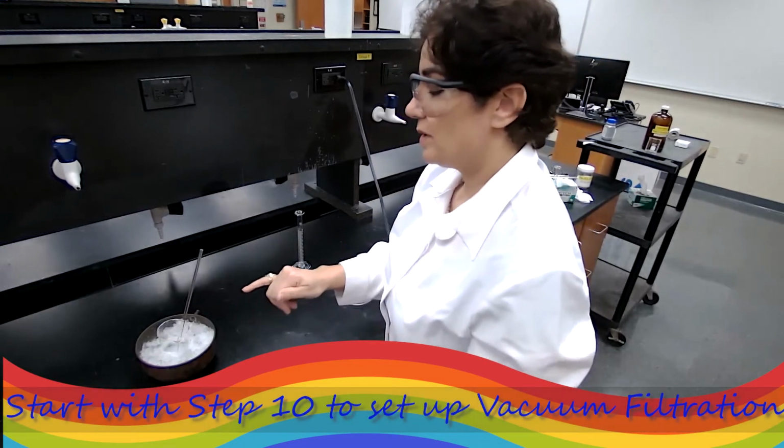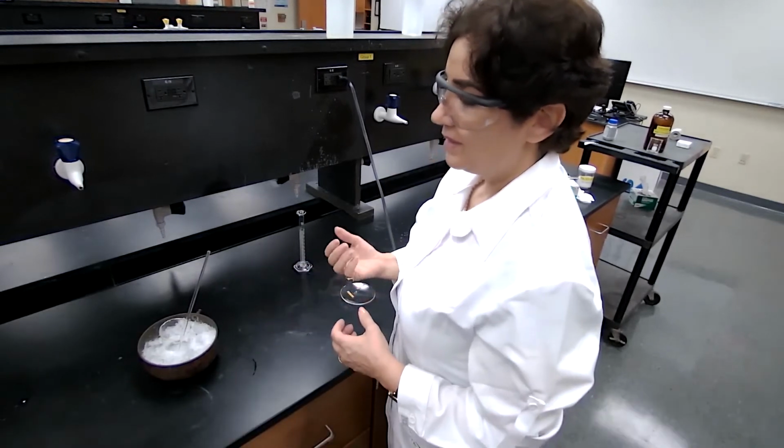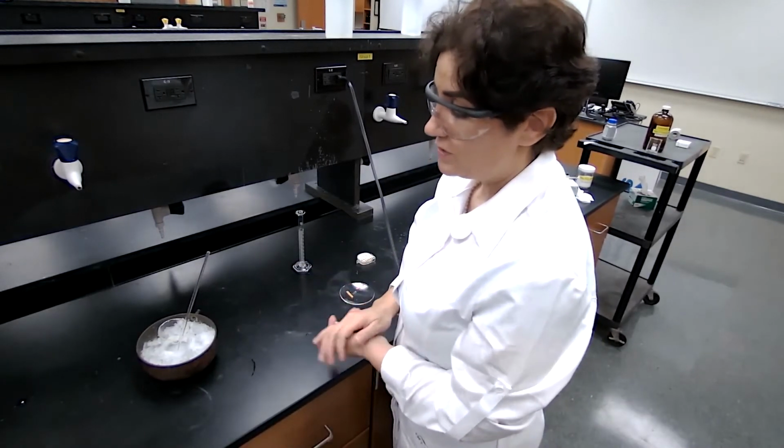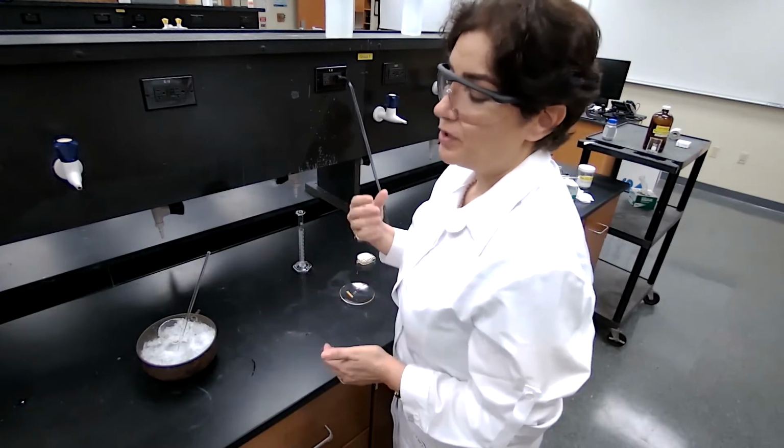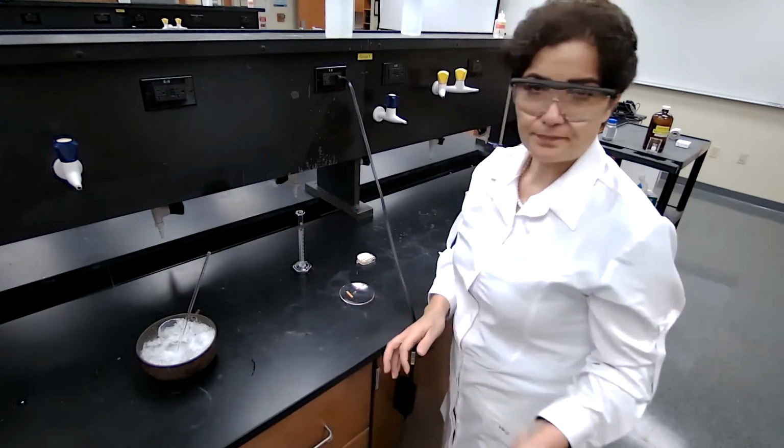We are going to vacuum filtrate, or we separate the crystals using vacuum filtration. While this is taking place, I'm going to prepare my vacuum filtration apparatus.